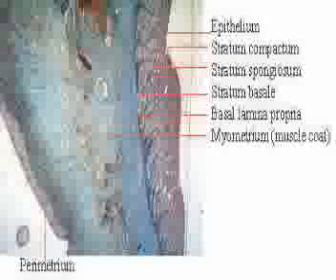The human uterus is a unique organ, for it is cyclical and therefore allows structural changes within the cycle called the menstrual cycle. It has three coats: endometrium, myometrium, and perimetrium. The endometrium is further divided into three parts: a compact layer, a spongy layer, and a basal layer. Below the basal layer is a basal lamina propria, followed by the muscular coat. Its epithelium is made up of simple columnar cells which form uterine glands.